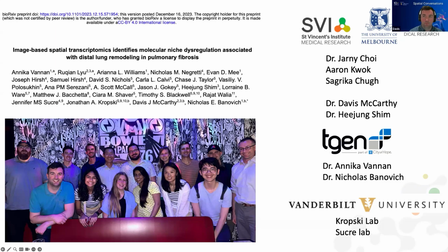Yeah, I think they have merit. So I think my current thinking at a high level is that no one approach perfectly solves all of the challenges of cell segmentation. I think ProSeg and things like that that think about density are useful. And again, I think the chemistry-based approaches to doing a better job of cell segmentation will help with the tractable parts of cell segmentation, where there's a clear cell that's nicely sampled in our XYZ slice. So I think they will contribute there and help there.